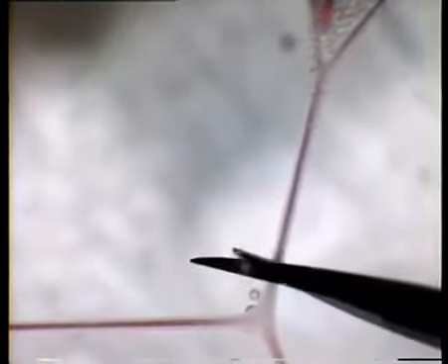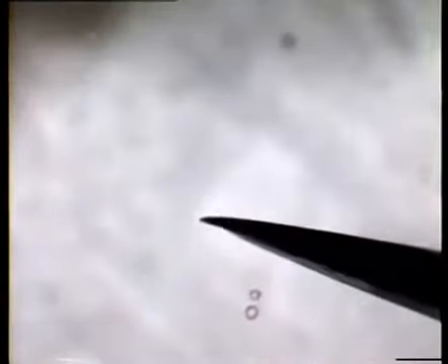Here the second branch is being cut away, leaving a little side branch that can be used as a handle to move the vessel to the myograph chamber.